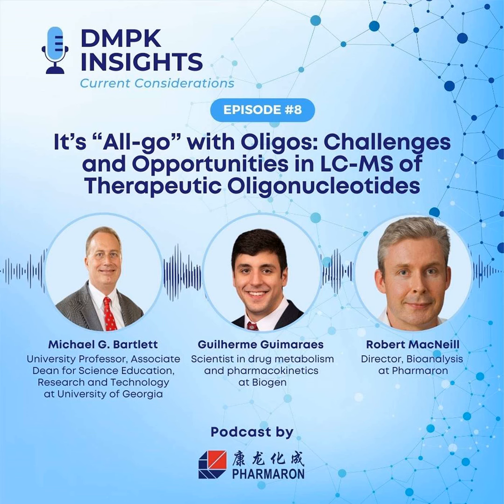I think we have a pretty good handle on the ion pair reverse phase retention mechanisms and the electrospray desorption mechanisms for it now, because we've had a 10 to 20 year head start on people really thinking about it and studying it. And we're going to have to go through that with HILIC, I think, now too.